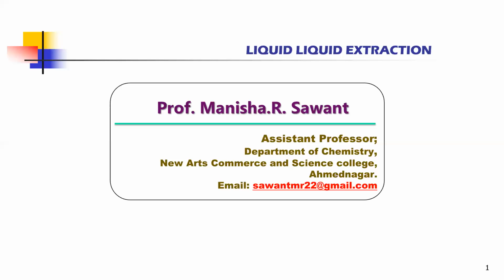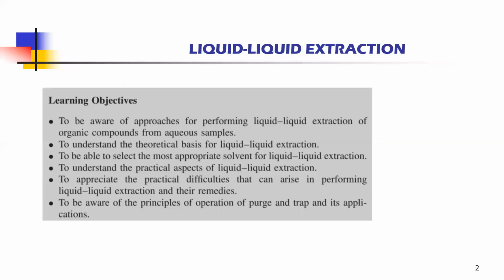in this second chapter. The objective of liquid-liquid extraction is to be aware of approaches for performing liquid-liquid extraction of organic compounds from aqueous samples, to understand the theoretical basis for liquid-liquid extraction, and to be able to select the most appropriate solvent for liquid-liquid extraction. The next is to understand the practical aspect of liquid-liquid extraction.